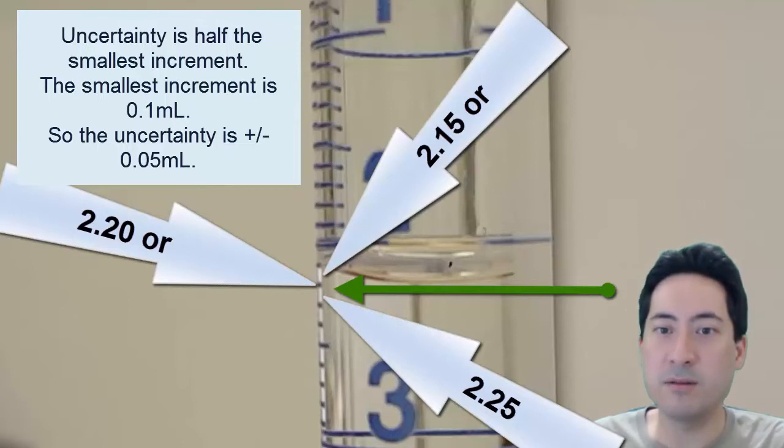If you're just reading to the 2s and it just reads 2.20, 2.30, 2.40, it's pretty clear that you're not, and all your readings look like that, you don't have 2.35 or whatever, it's pretty clear that you're not really looking to see whether it's closer to half the smallest increment. And so that's probably the first biggest error.